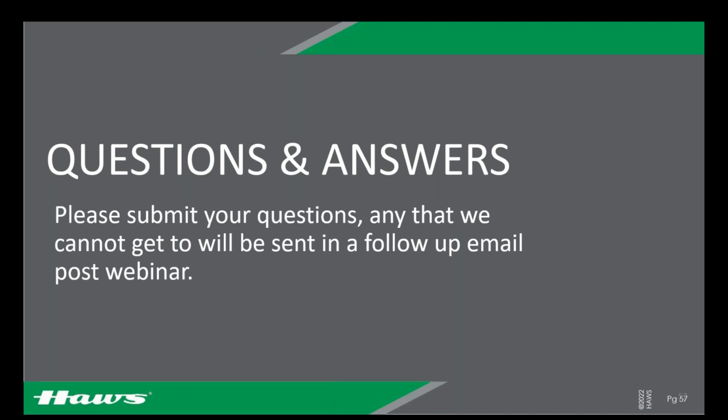Somebody has an emergency, it clicks, oh, we have that one over in this lab or this area, and they run to use it and it's non-functioning, that is a serious issue for you, and a potential litigation type of situation that we could avoid. So just take it out, uninstall it, put it in storage until you need it, whatever you need to do, but don't leave it there.